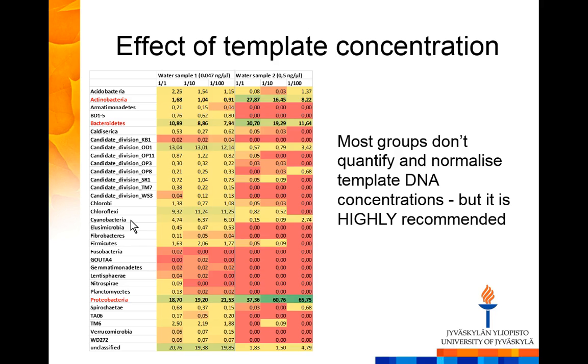Yeah, it's the same when we analyze plant roots or when we want the entire root community, also the endophytes living within the root. So then we just freeze dry and break the entire sample, and then most of it is plant DNA. What you could then do is quantify the amount of your prokaryotic cells with qPCR. We do that next because with biopsies we have so little sample that we might do nested PCR. We do the same actually with the root communities.